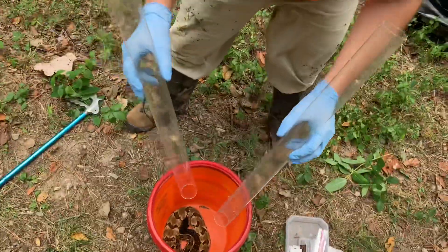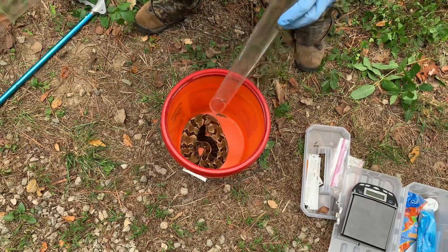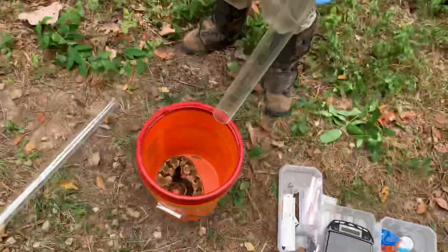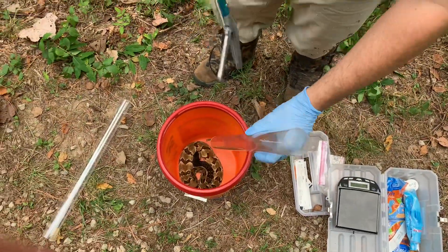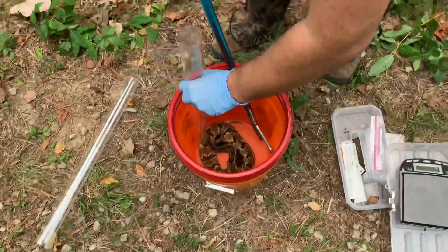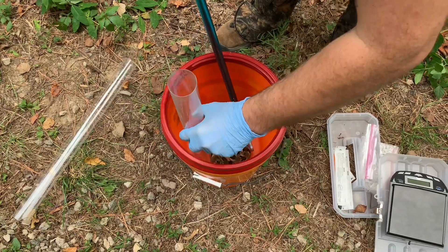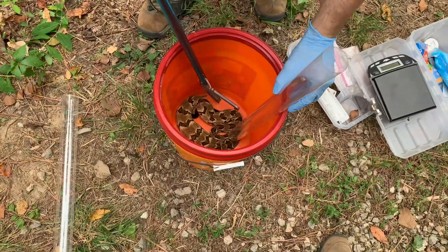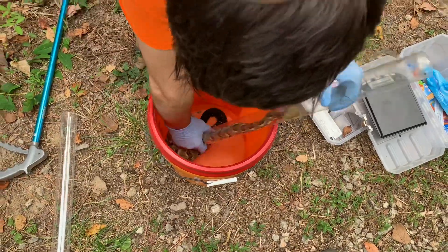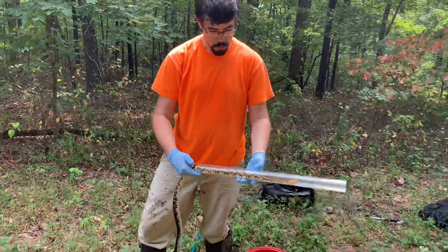First things first, I want to figure out which one of these tubes will fit her more snugly because I don't want her to be able to turn around in the tube. I think this will be our best one. The trick is just getting them to actually go up inside the tube, which can be much easier sometimes than others. I'm just trying to start her head in there and gently prod the back of her, and then once she's nice and far up that tube, just grab her. She looked a little heftier than I thought she was.